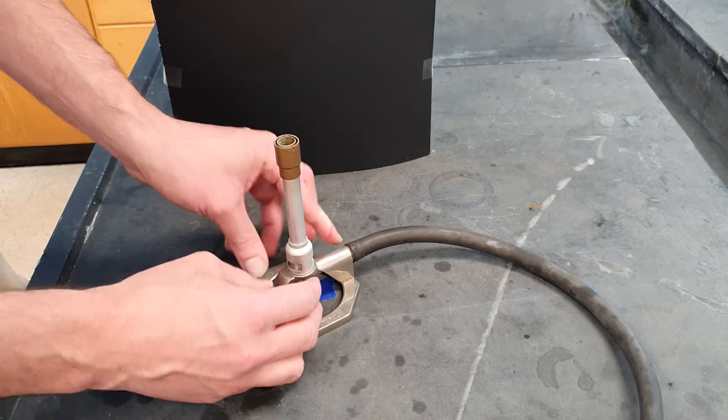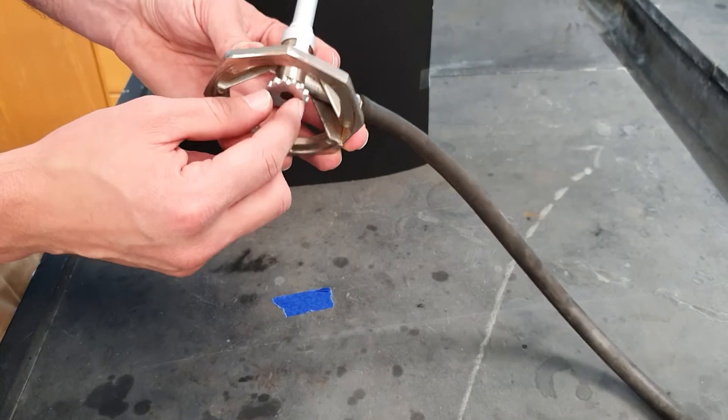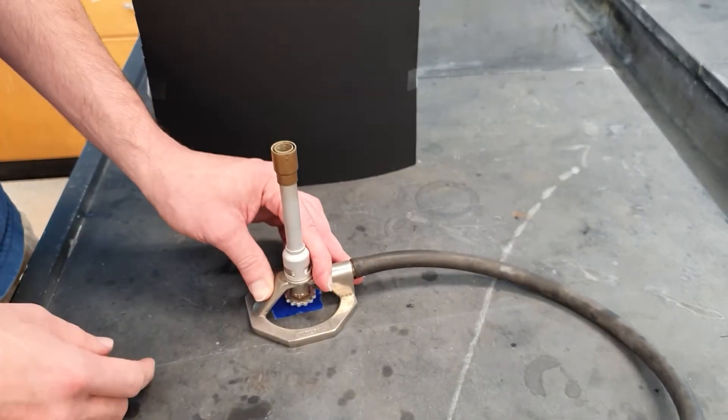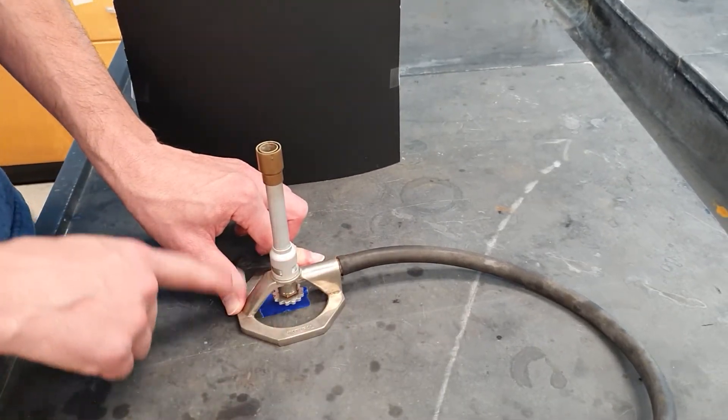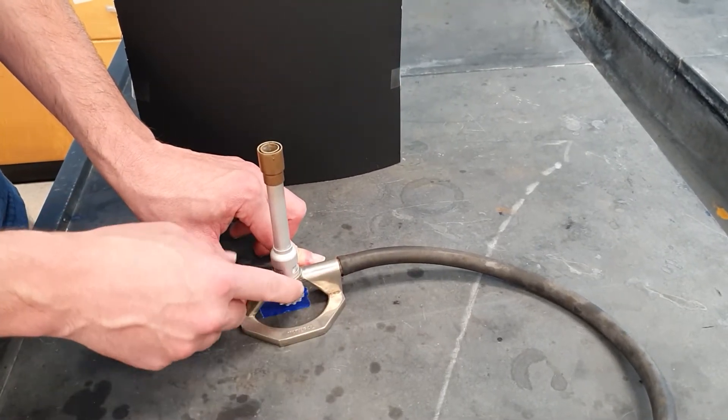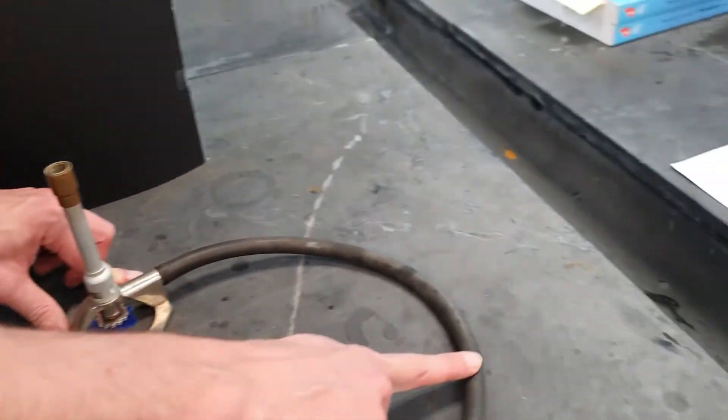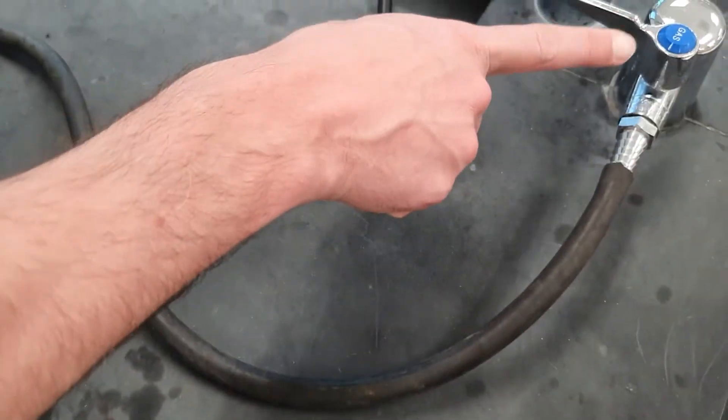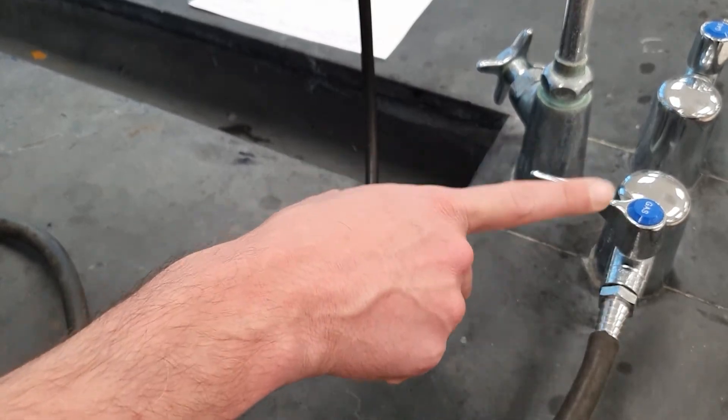When you start, the airflow valve should be closed, that means screwed all the way down, and the gas flow valve should be closed, meaning screwed all the way up, so that no gas can flow. Before you do anything, you check all your equipment. Make sure this is good, having no damage, that everything's closed. You make sure that this is good too. The gas line needs to be free of cracks or damage, and then here, you need to make sure this is closed. Don't start doing things with it being open.